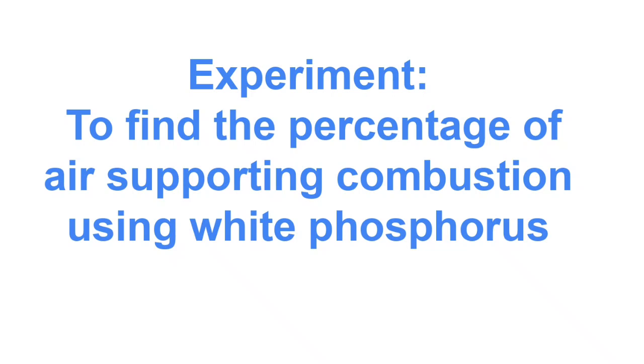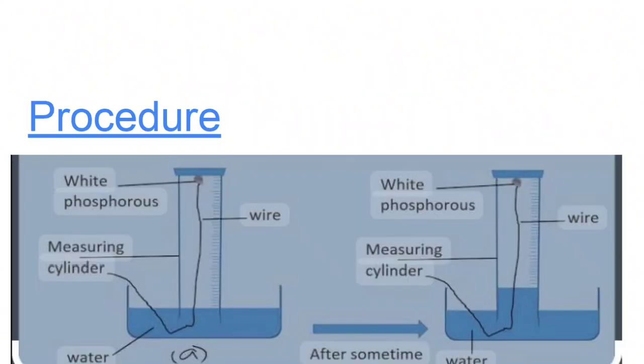An experiment to find the composition of air supporting combustion using white phosphorus. Welcome to our class. The procedure involves the following steps.